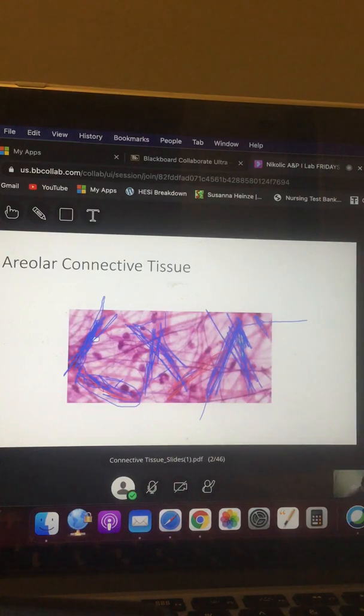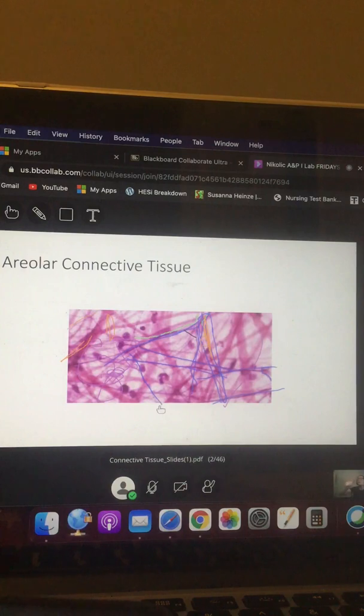Now, let's go to the second type of fiber you need to know. It's very easy. Shocking no one, elastic fiber is the line that looks like a marker. Line. Elastic. That's it, people. Elastic. One line. Not thick, one line like you drew it with a marker. All right, are you guys ready?